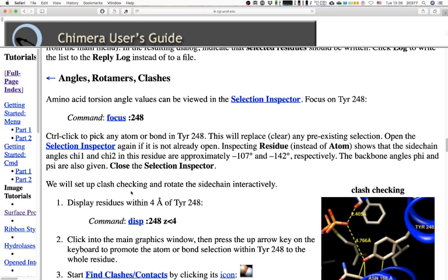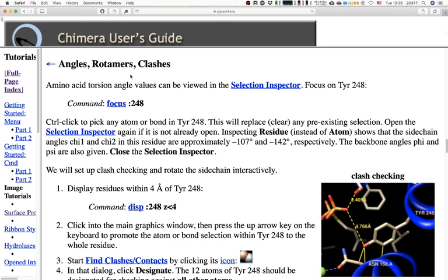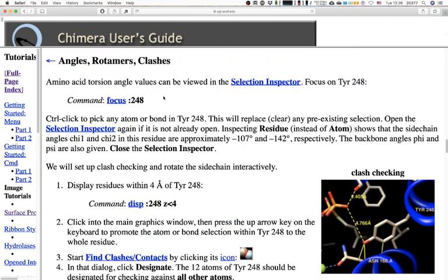We've been going about 26 minutes. Let's continue. The next section is angles, rotamers, and clashes. We did contacts and hydrogen bonds; now we move on to more comprehensive analysis. For example, the tutorial wants us to start by looking at the torsion angle chi values in tyrosine 248. Let's focus on it.